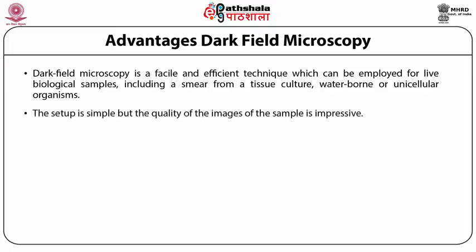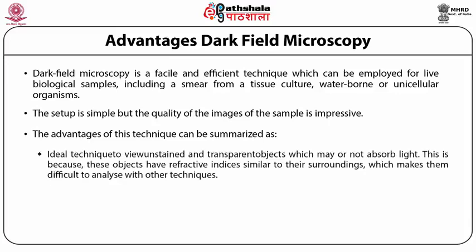The setup is simple, but the quality of the images of the sample is impressive. The advantages of this technique can be summarized as: first, it is an ideal technique to view unstained and transparent objects which may or may not absorb light.